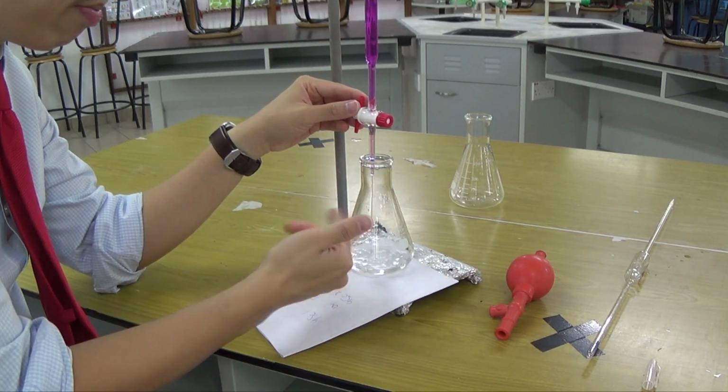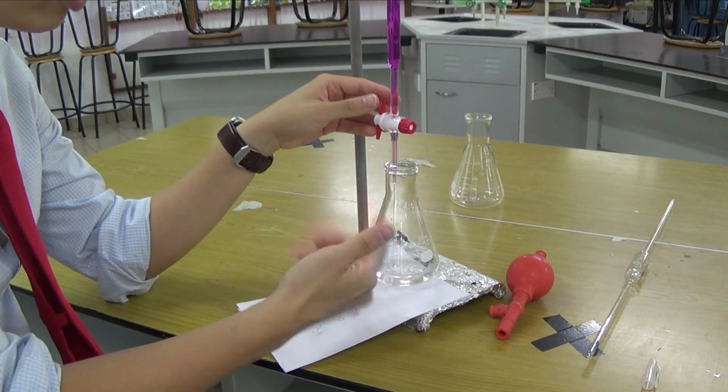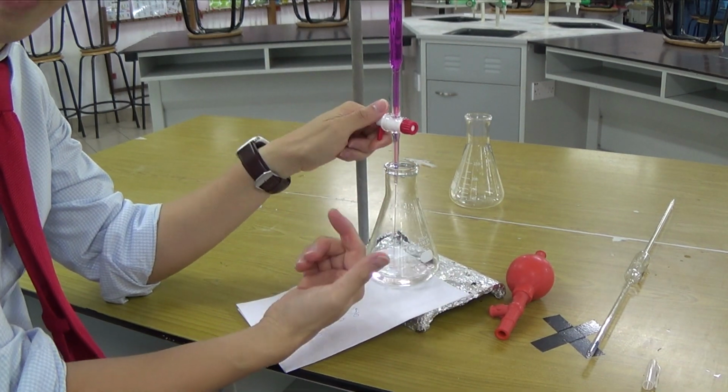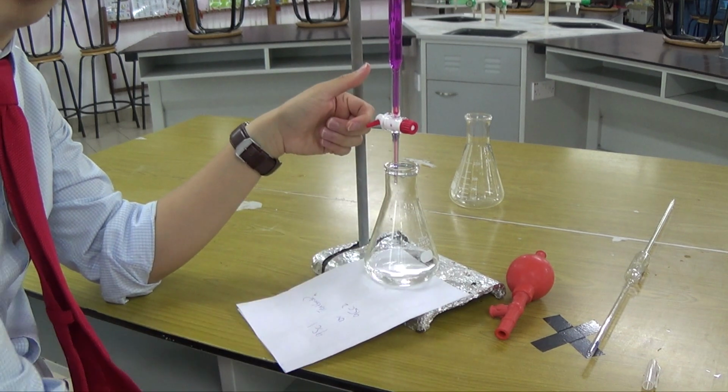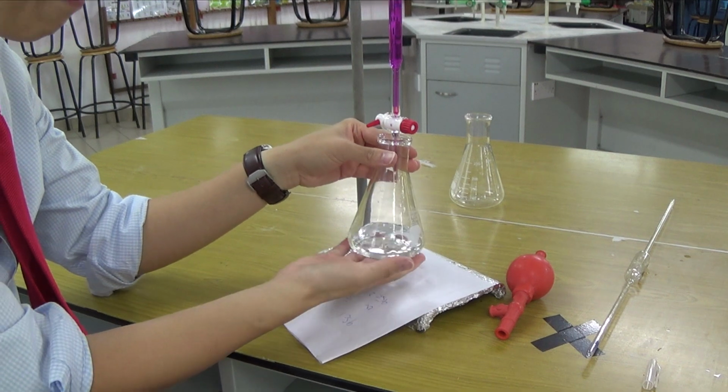As you could see, it remains kind of colorless as well, because there is still a lot of iron 2+ left in there. The iron 2+ gets converted to iron 3+ in solution, which is also very pale, kind of pale yellow.